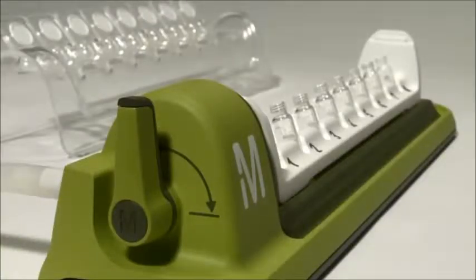The vial tray is angled, so you can easily view vial contents. Plus, the angle of the vials allows the filter to drain along the side of the vials, eliminating foaming.